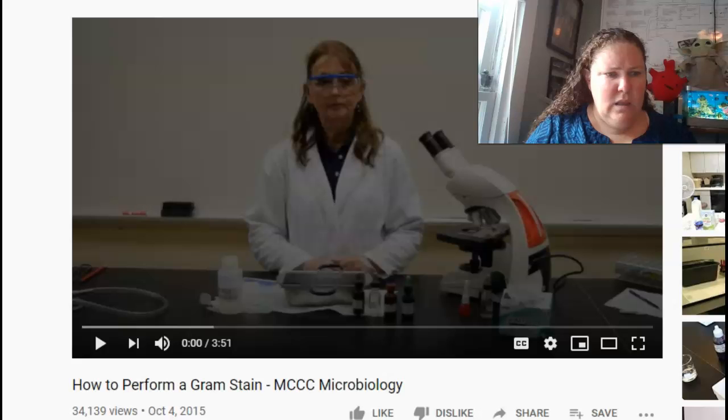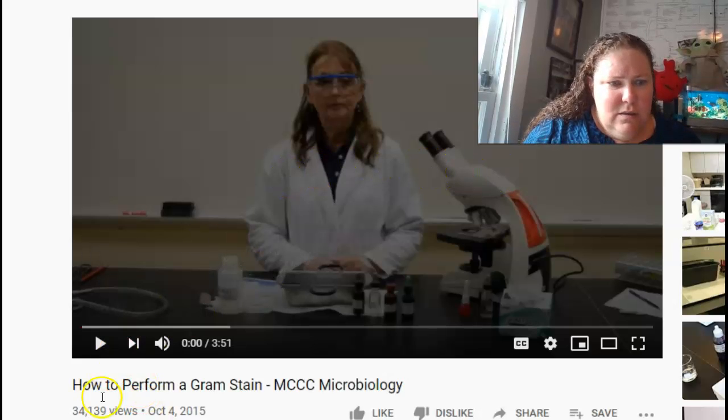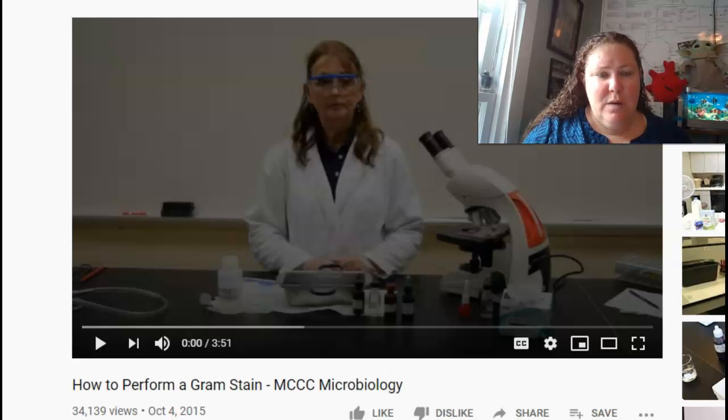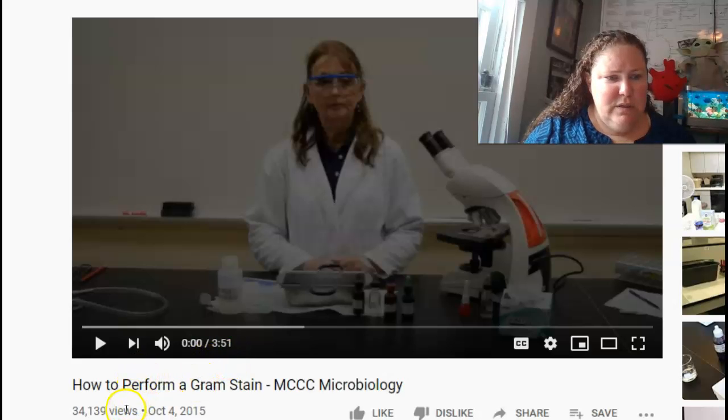So hold on one second. Okay, so let's see if we can get this to play and record. I'm trying to make it so that you can hear it, but I don't think that's going to work. Okay, so look up a gram stain, and we'll talk about this in lab too, but you can see how you can actually perform it. Ooh, I wonder if that works. Maybe. Okay, so look up a gram stain, okay?